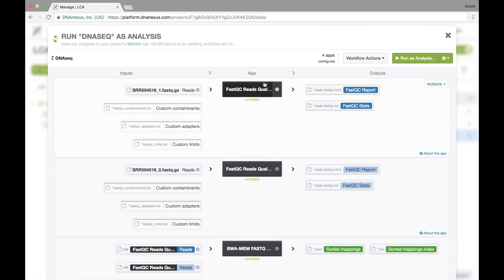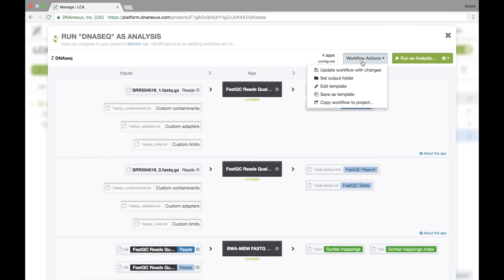However, before we do that, I want to talk a little bit about structuring the output for our workflow. Under workflow actions, we can set the output folder for the entire workflow, meaning each stage will output its contents into whatever folder we choose.